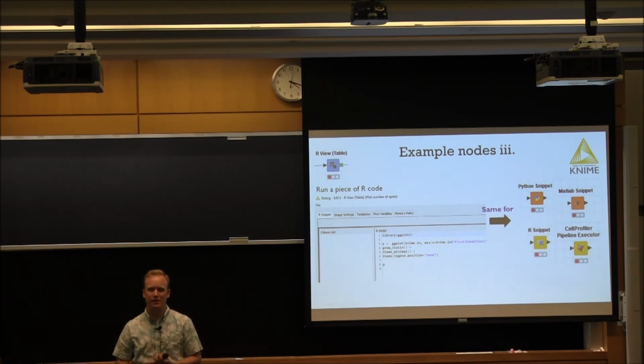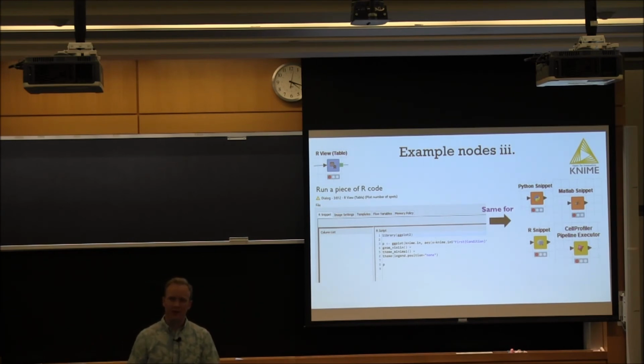Sure. So you mentioned there's a genomics extension. What kinds of things do you know that people usually use it for? I think it's mostly sequence manipulation, essentially. I haven't used it myself because I'm an imaging guy, but it's mostly sequence manipulation. There's extensions for crazy different fields. There's a really good one for chemistry as well. There's very good ones for the financial sector, and you can download the extension, and then you have access to all those functions too. So there's sometimes crosstalk as well.